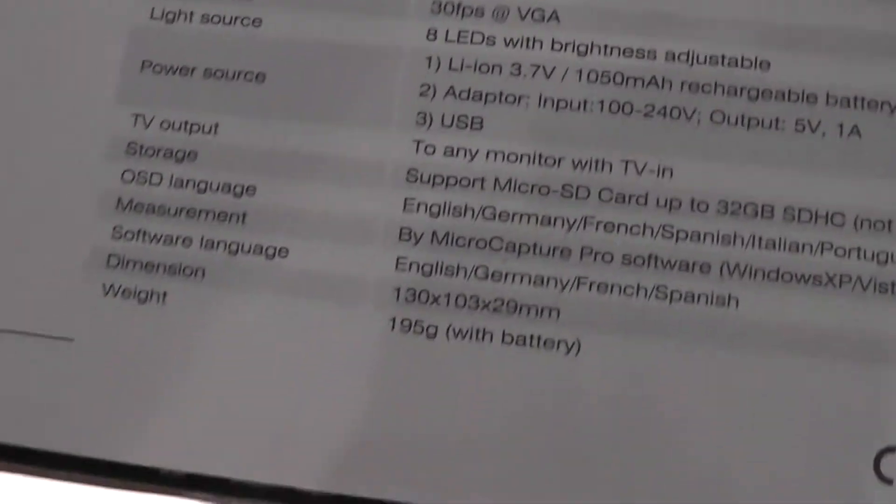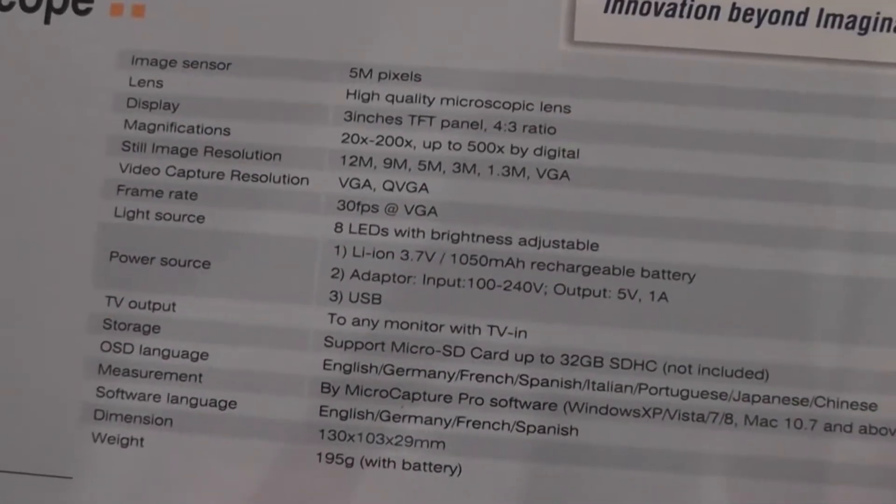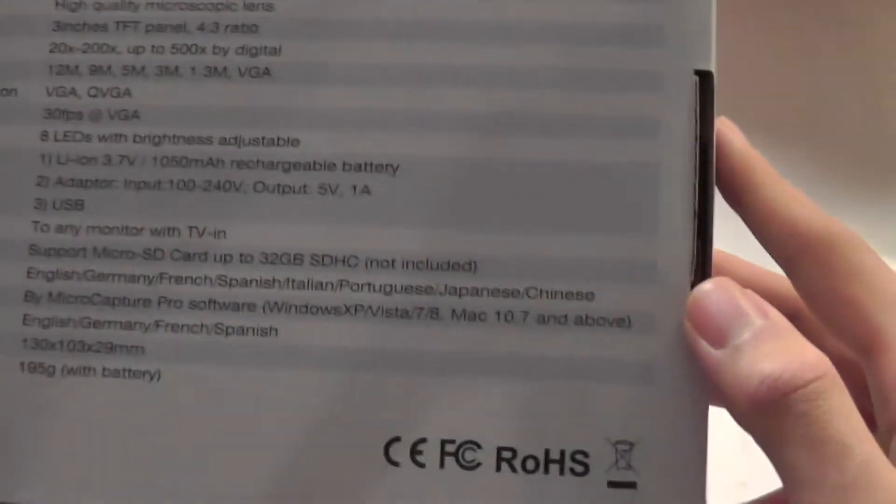The back features more specifications if you're interested. It connects via micro USB for charging and syncing, and charging takes up to two hours to fully complete.